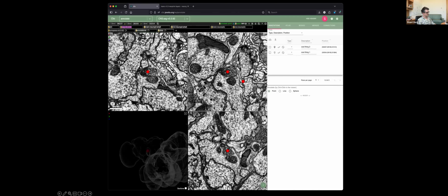It incorporates Neuroglancer as a component, and a couple of speakers earlier have already mentioned how that could be a challenge. I'll say a few words about that a little bit later. It offers users the ability to drop their own annotations, which get stored on a server.